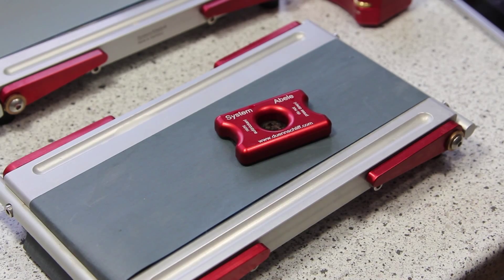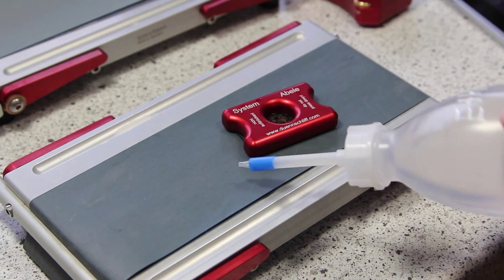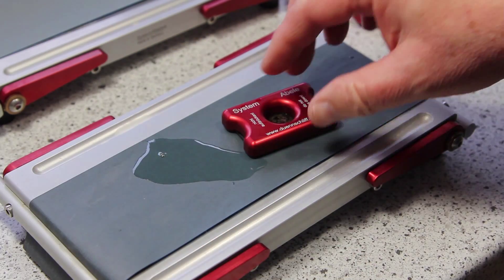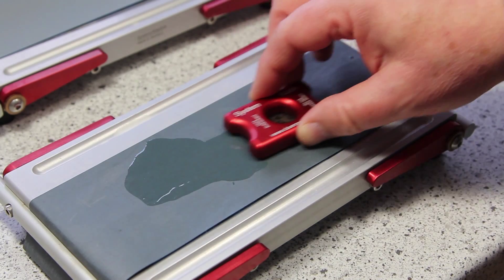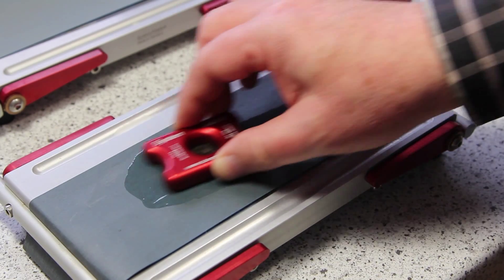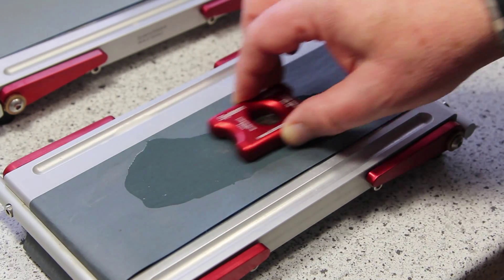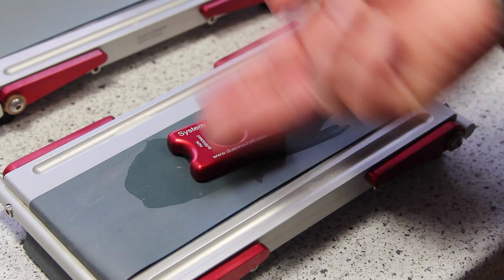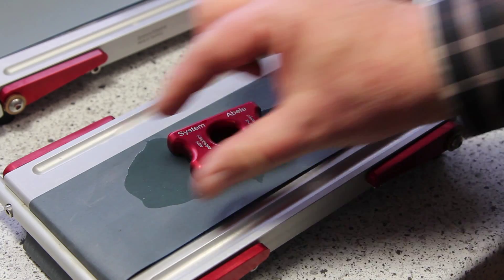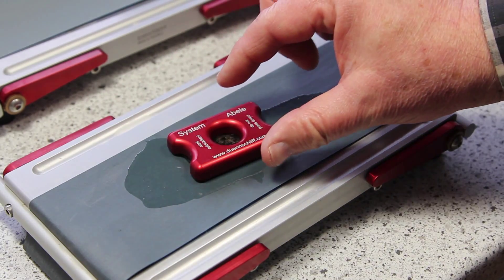And now I put a little bit of ethanol on the surface and I finish the surface of the sample. The machine moves this way and I move crosswise.